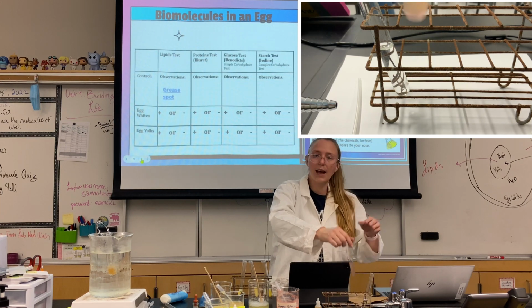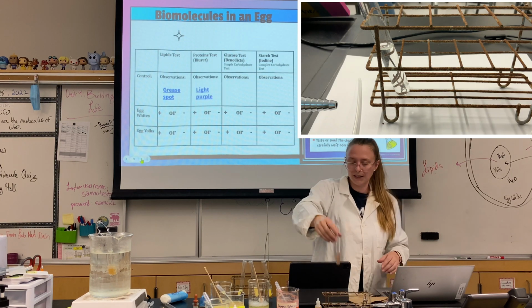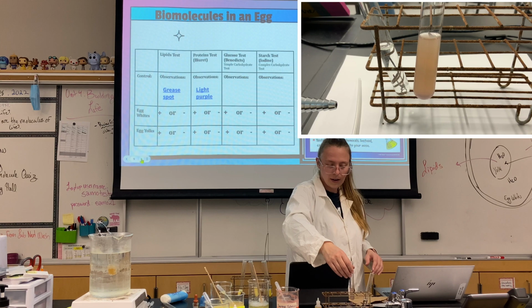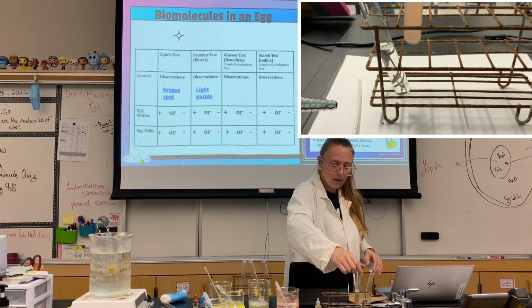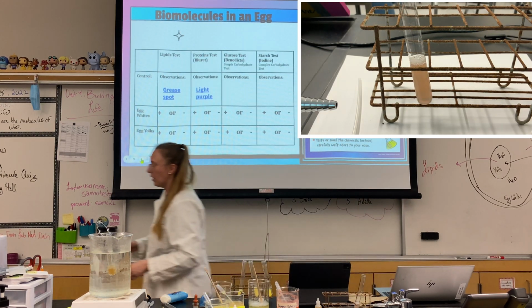So for the lipids test, we're going to see a grease spot. And our protein test, we're going to see kind of a light purple. You see how that's a very light, very faint purple. Let's shake it up again. There we go. Okay. Now we're going to test for, this is just water.